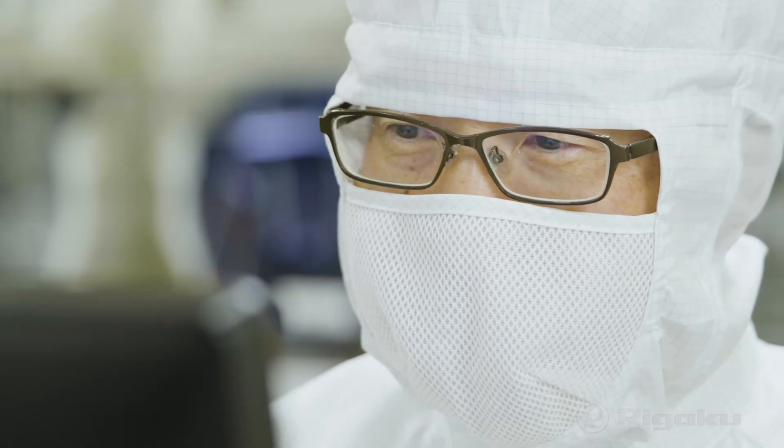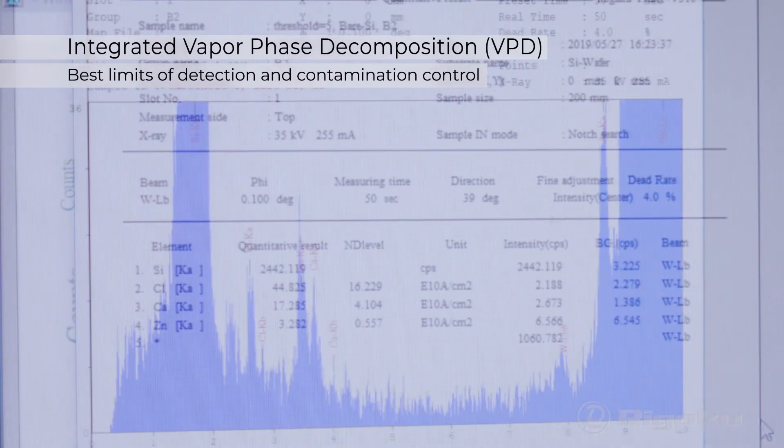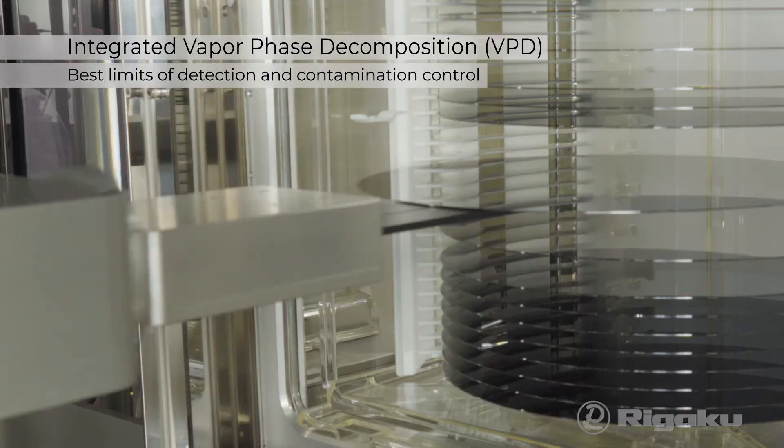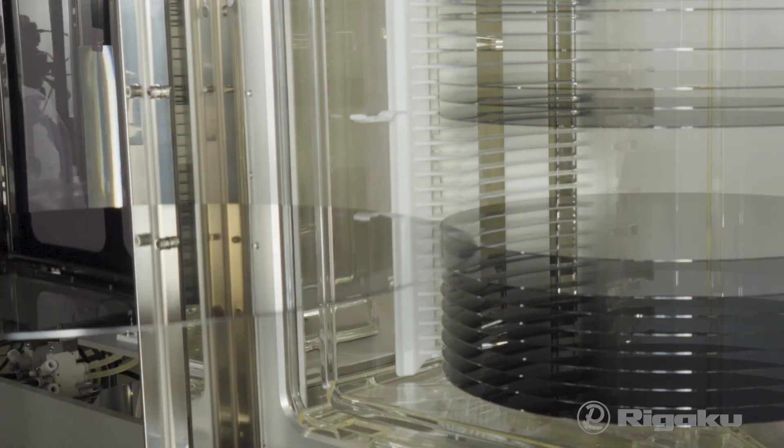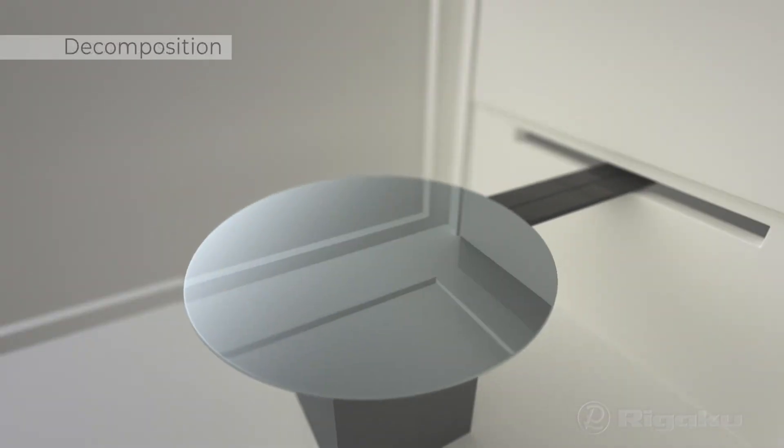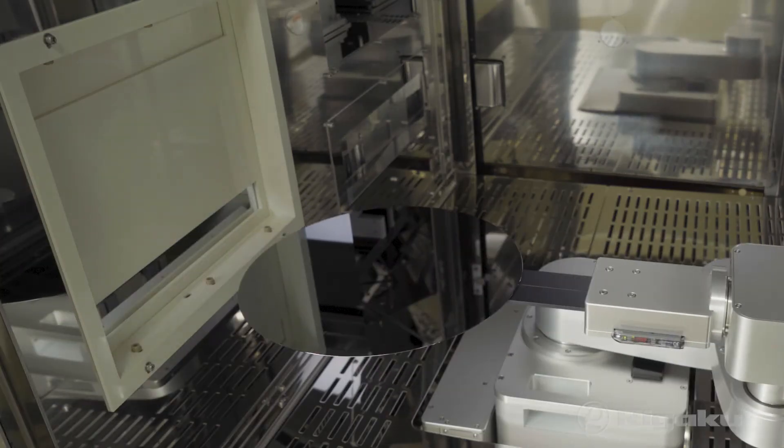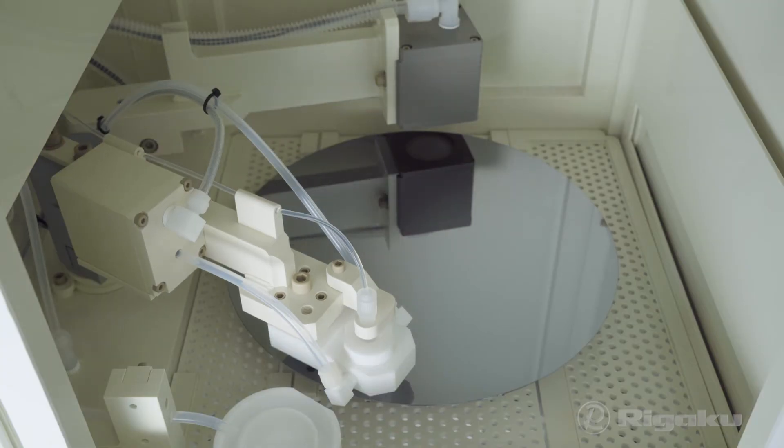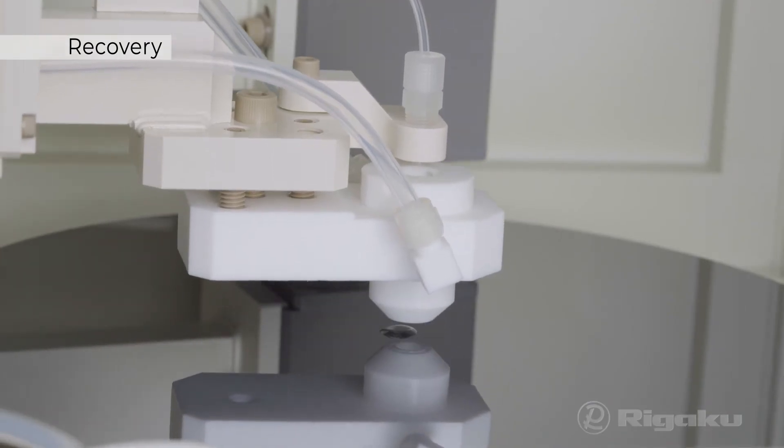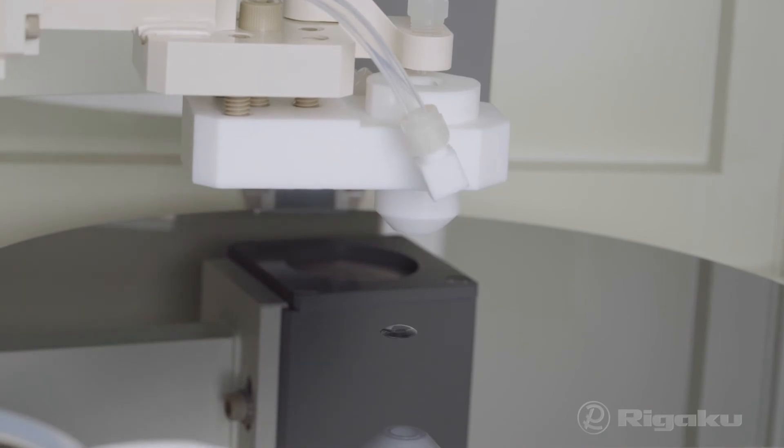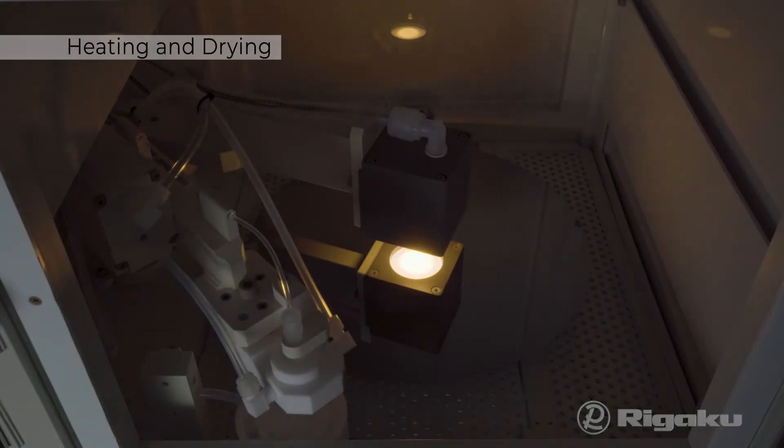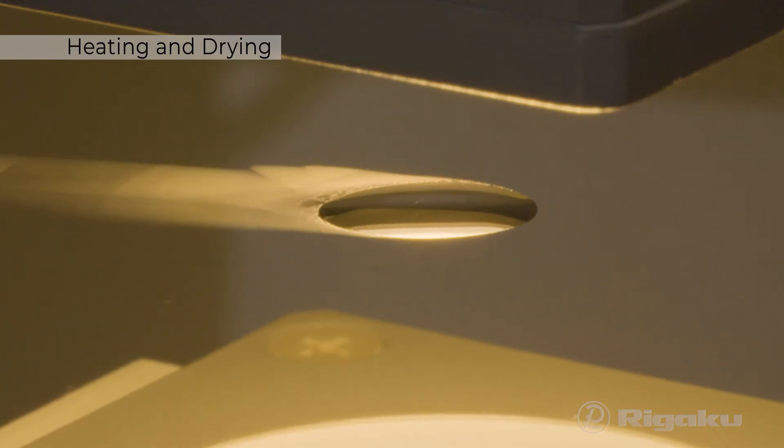Fully automatic VPD delivers best limits of detection and contamination control of trace elements by decomposing oxide film on the wafer surface. Using recovery solution to concentrate all contaminants to the wafer center, then heating and drying for TXRF analysis.